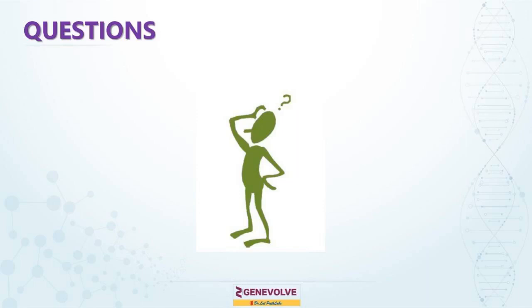So Ion Torrent uses a non-optical method for base calling. How advantageous is this for homopolymer errors that we see? So homopolymer region is a region which definitely is a concern for NGS, and as bioinformatics has improved, this concern has really been going down. And if we see something which is covered in a homopolymer region and could be pathogenic or likely pathogenic, definitely Sanger is the way out. And the current guidelines say that you need to do a Sanger sequencing if you see something in a homopolymer region. So that is what we are doing currently in the lab.